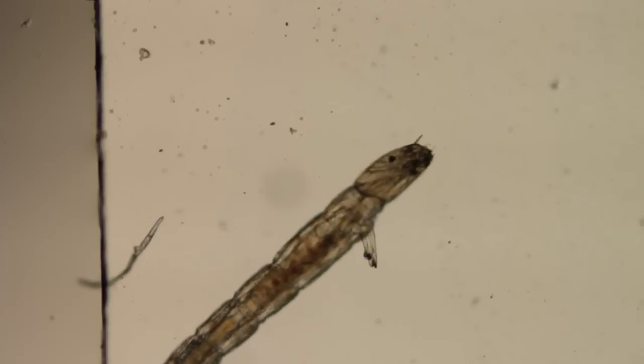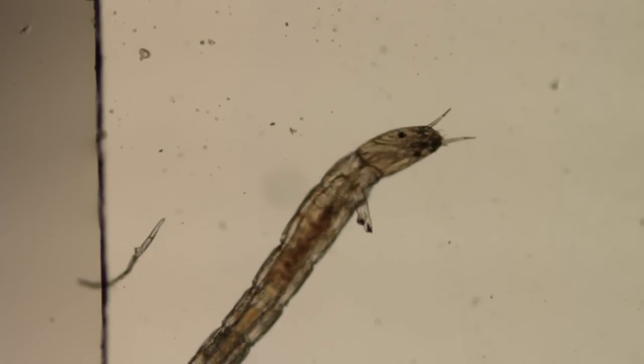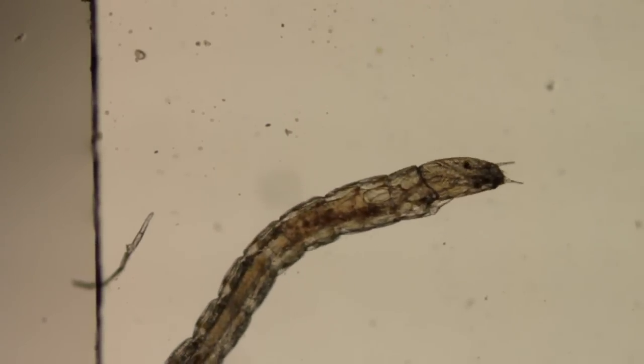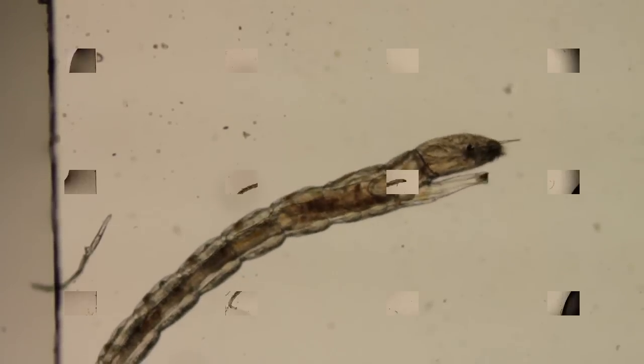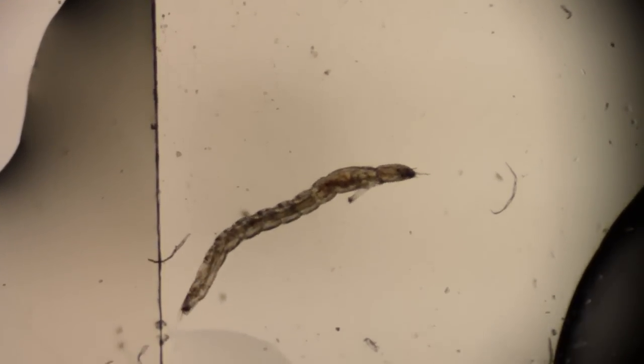Watch his antennae. Whenever he swallows or cleanses his throat, those go in and out one at a time. They don't go both at once.